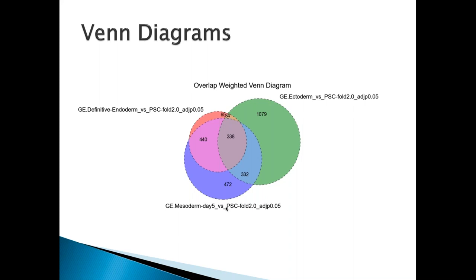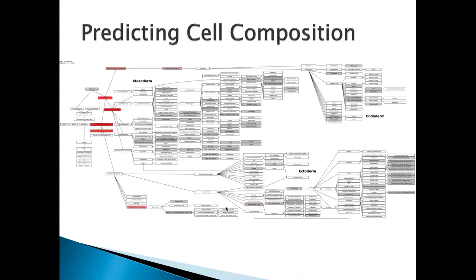There are other simple forms of representing data, such as Venn diagrams showing which genes overlap between different sets of differentially expressed genes — a weighted Venn where size of overlaps indicates how many genes are overlapping. There are also ways to predict cell type composition, where you have a lineage map of possible cell types and a sample is analyzed to predict its likely composition based on similarity to reference profiles. For example, a pluripotent stem cell RNA-seq sample would be most highly associated with pluripotent stem cells and related lineages, as expected.